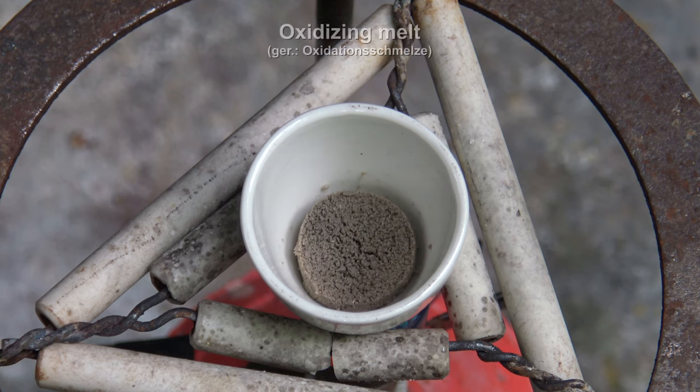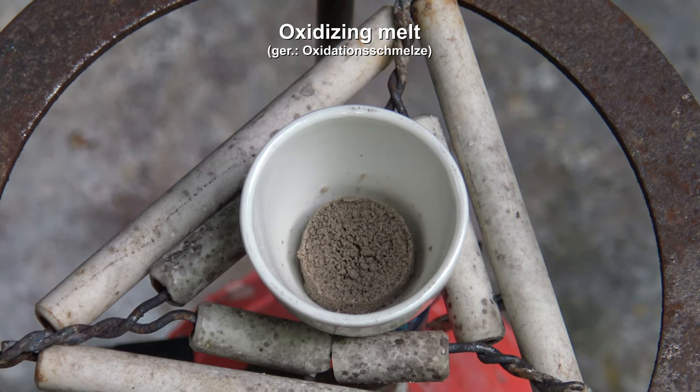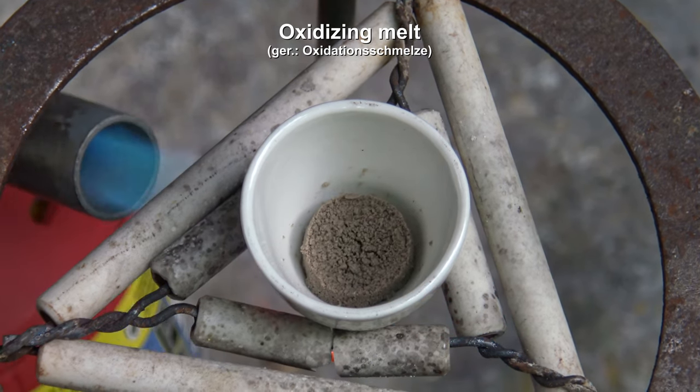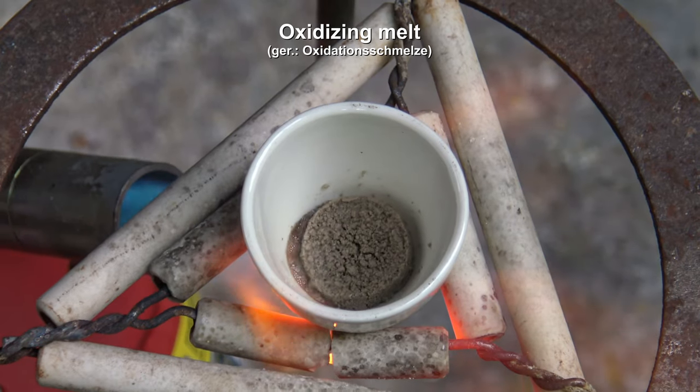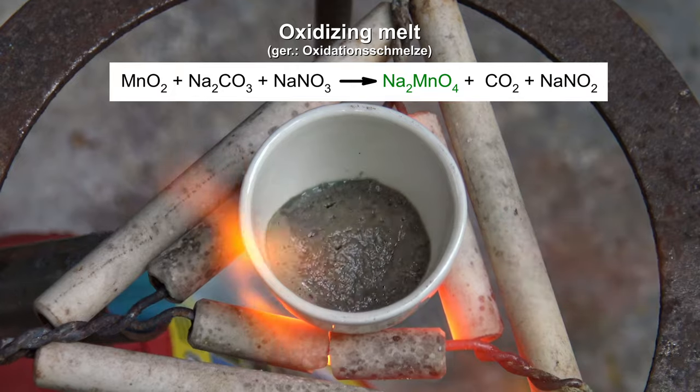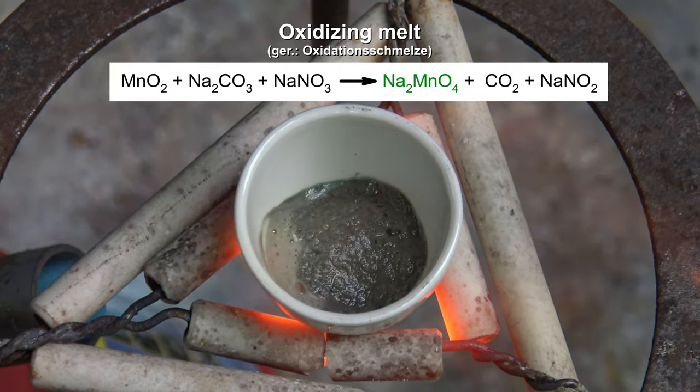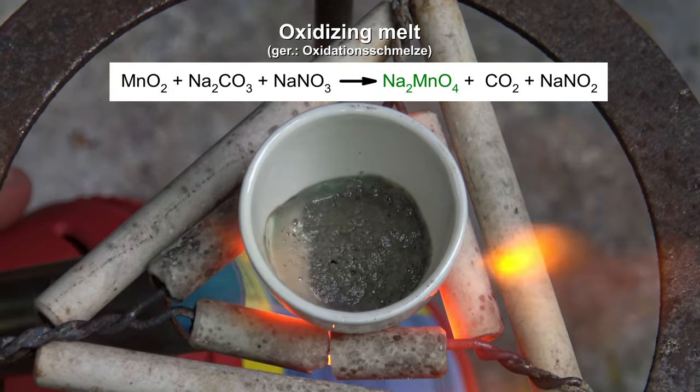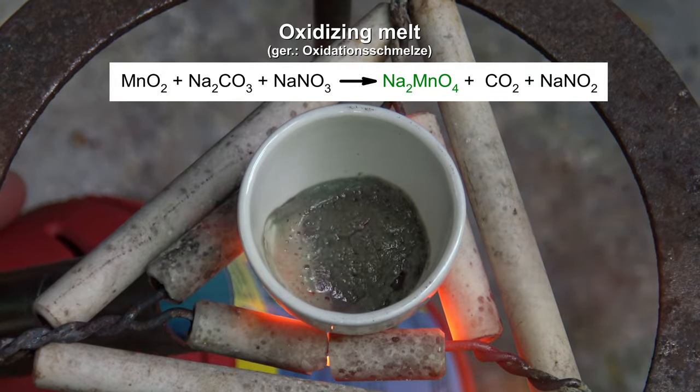This test can be translated as oxidizing melt, which is used to test for chromium and manganese ions. In this case, the manganese, which is mainly present in the form of manganese dioxide, is oxidized to the green manganate-6, while CO2 is released and the nitrate is reduced to the nitrite.